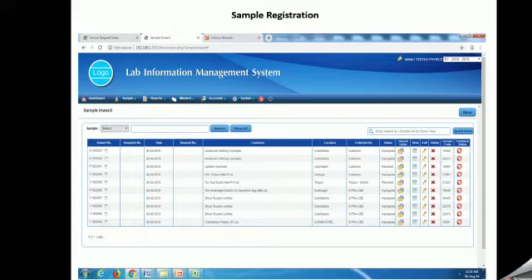The access code details provided here are used by customers for viewing the test reports online. While sending the test report mail to customers, there is a link given in the mail for providing customer feedback. Feedback provided by customers for the particular inward is also shown. There is a new option at the top of the screen for creating a new sample inward. The same look and feel is maintained in all the entry screens.